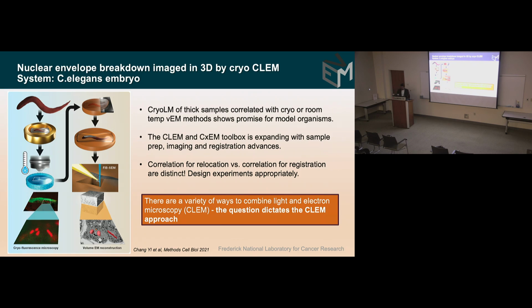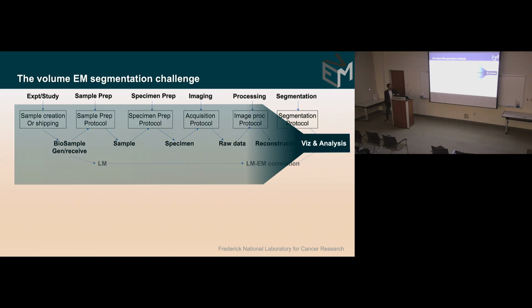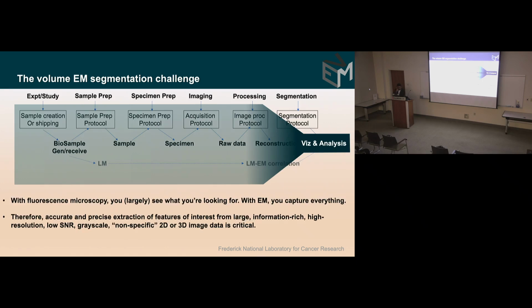Okay, very cool. So this is a slide that I presented a few minutes ago, in the experimental pipeline. Everybody knows this. Here's the bottleneck. Volume EM hardware and software has dramatically improved. The visualization and analysis is a real challenge for everybody, including, I believe, right here, right?